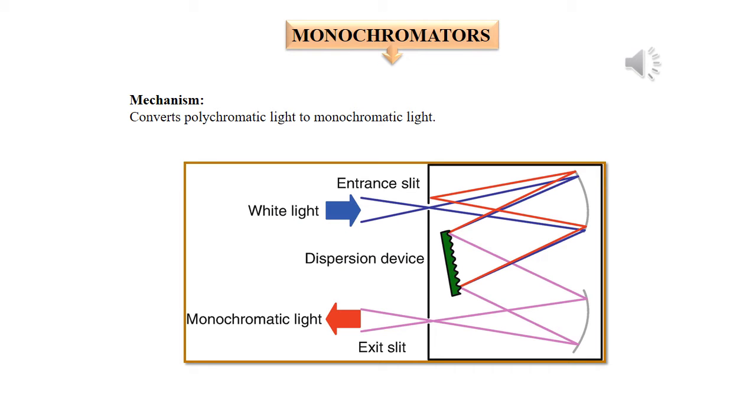Next, coming to monochromators as a part of the UV visible spectrophotometer. What are monochromators? Mono represents single, chrome represents color, single colored light. Here we are discussing about light, that is EMR, electromagnetic radiation. Light here represents electromagnetic radiation. So monochromators are nothing but they select single colored light. Colored here represents wavelength. Single wavelength light is going to be separated from multiple wavelength light.